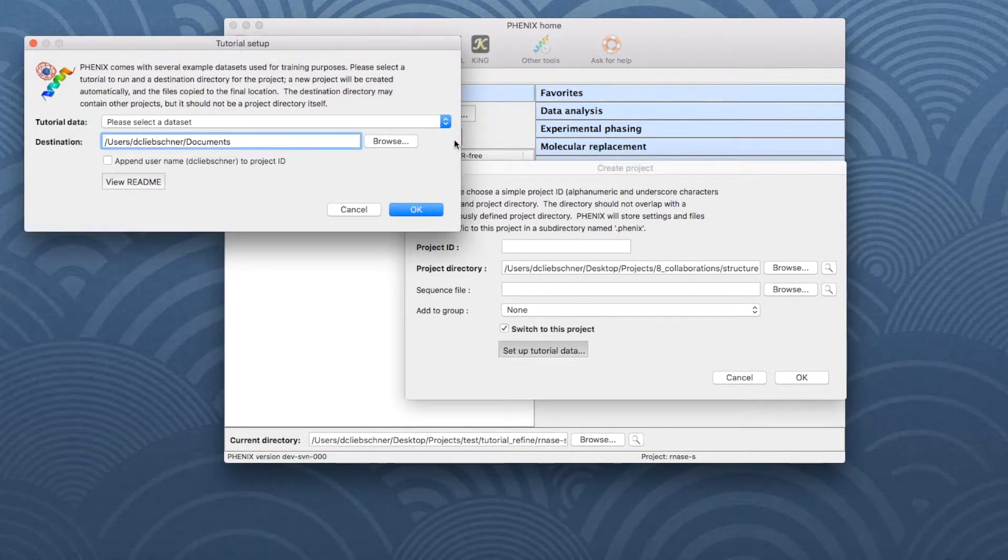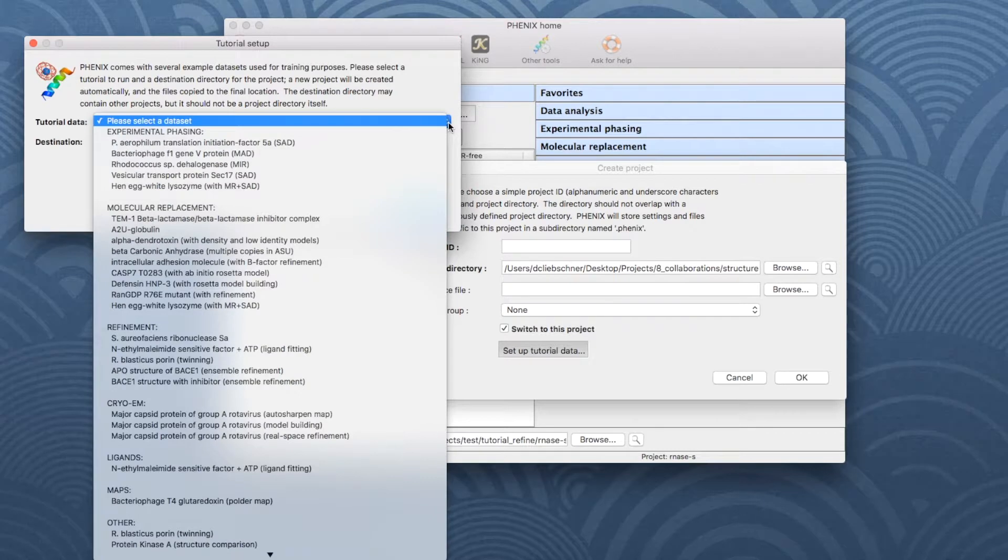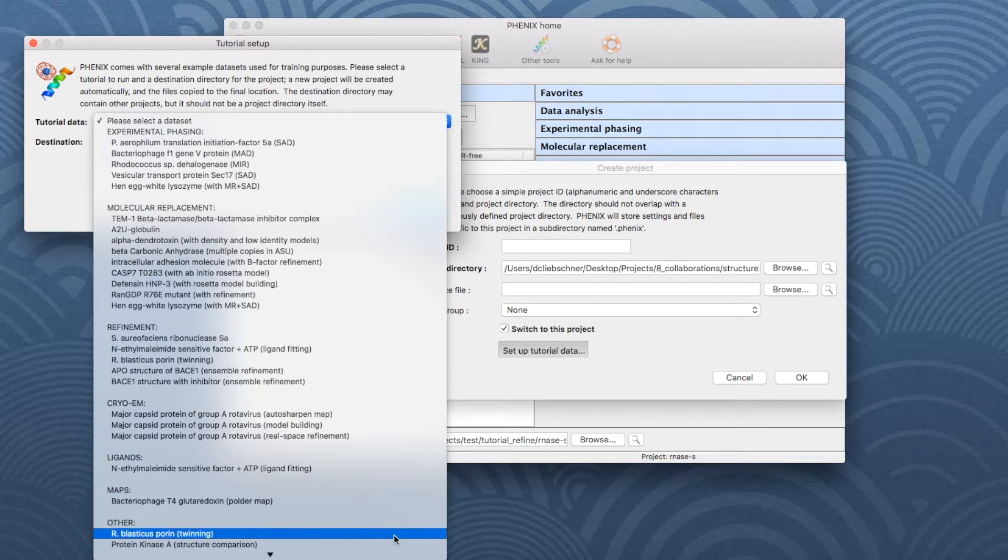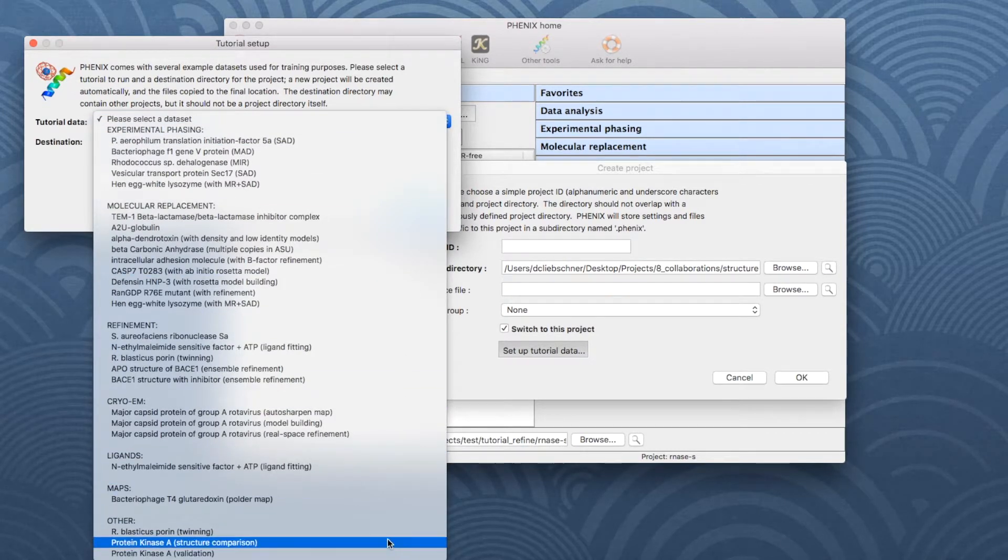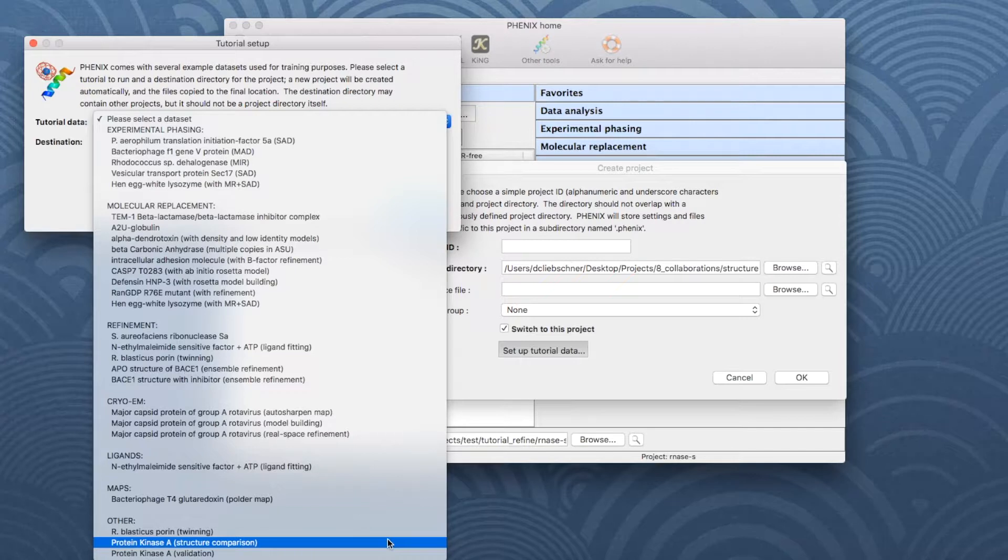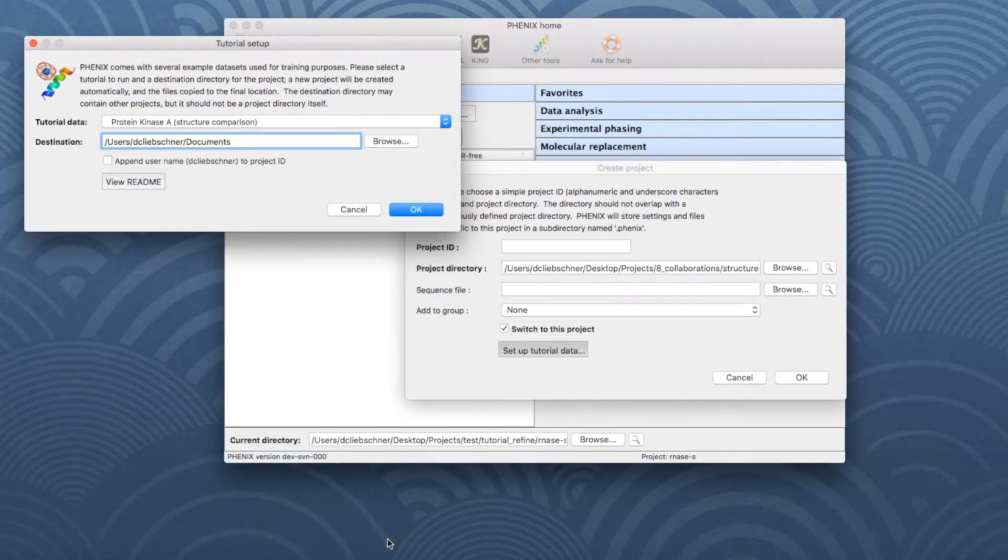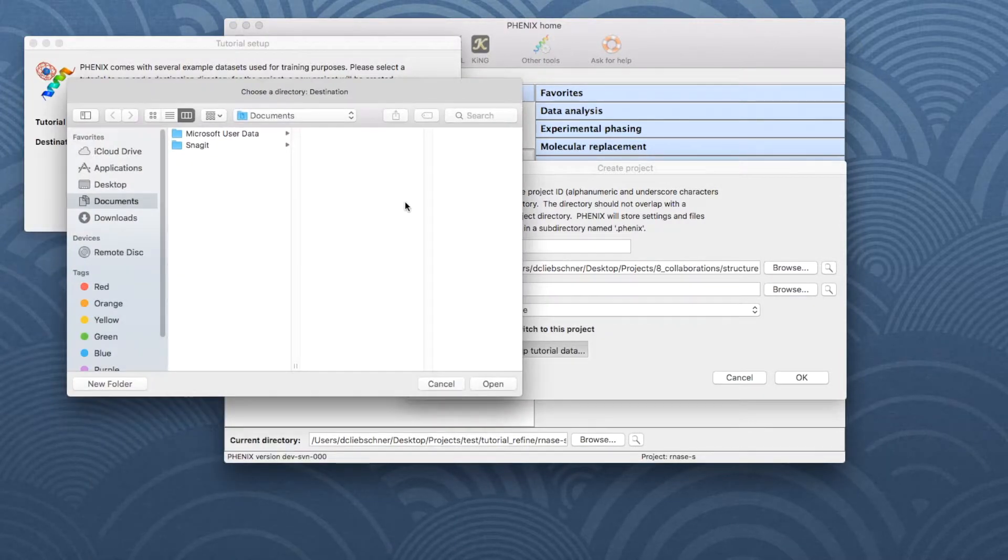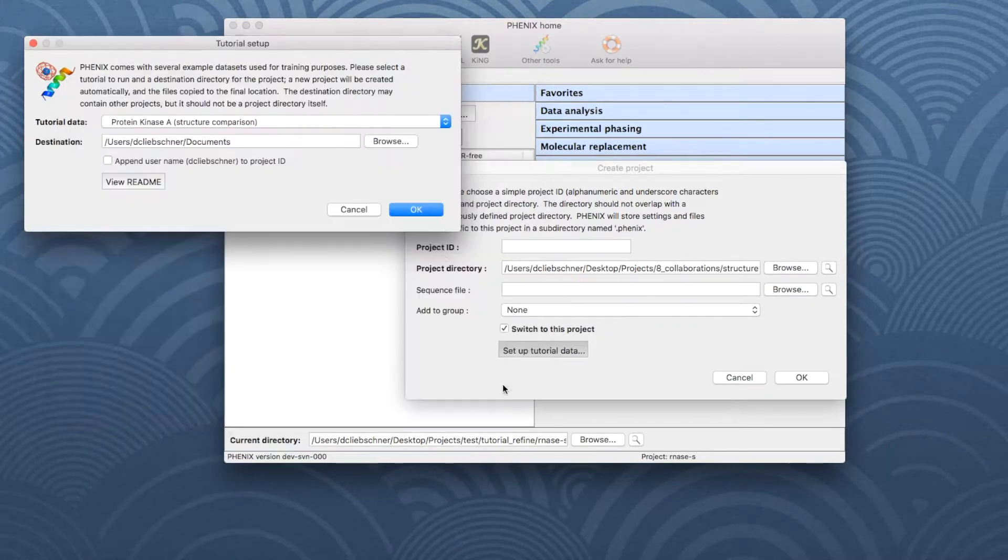In the new window, open the drop-down menu next to Tutorial Data. Go down to Other and choose the dataset in the middle, called Protein Kinase A Structure Comparison. Choose the directory and then click OK.